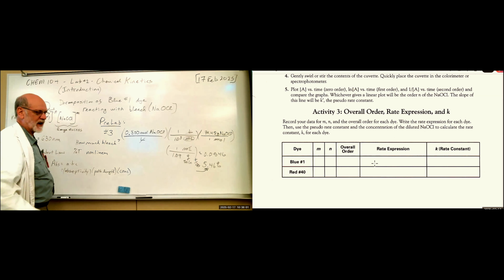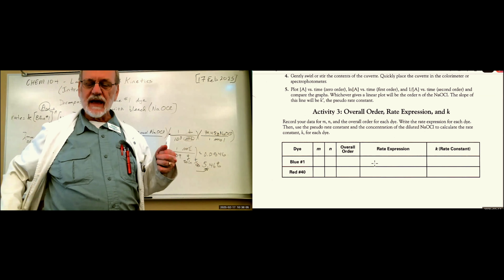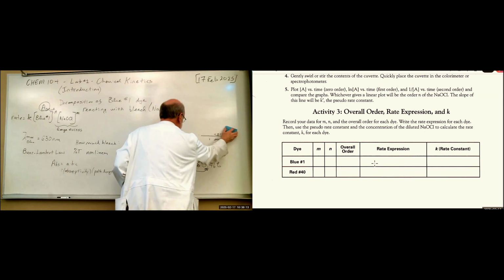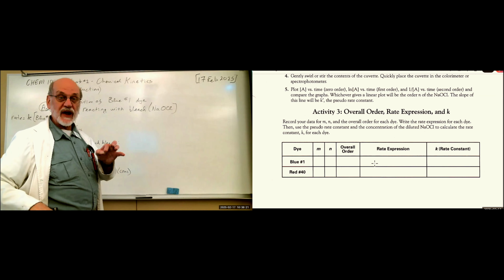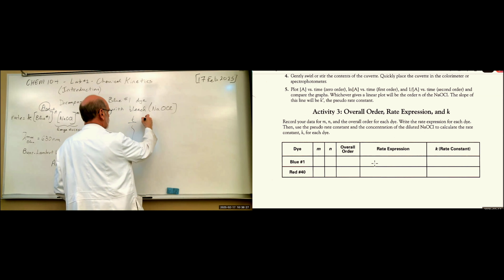And then the sodium hypochlorite, we're going to get 2 sets of data. And then when we have those 2 sets of data, remember what we do with the data? When we talked about it in the lecture, it was actual molarity, but we're going to have time as one factor, and then we're going to have absorbance as the other factor.